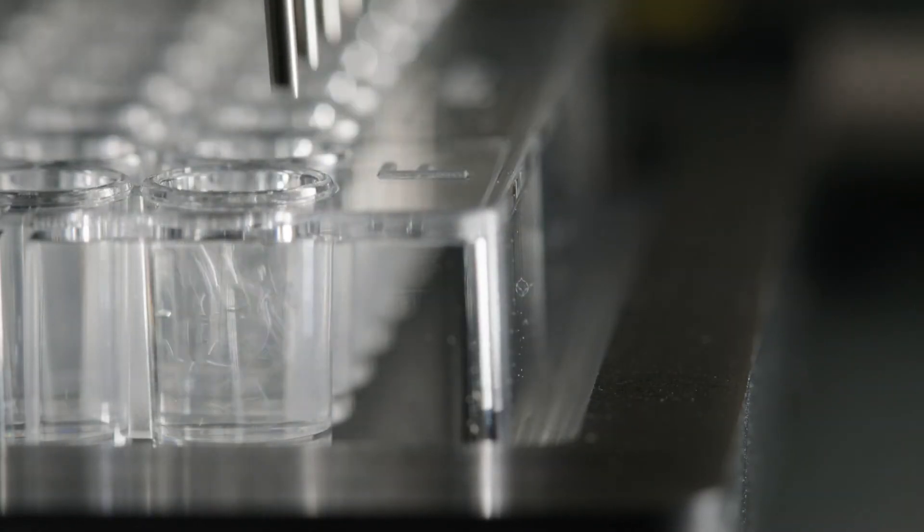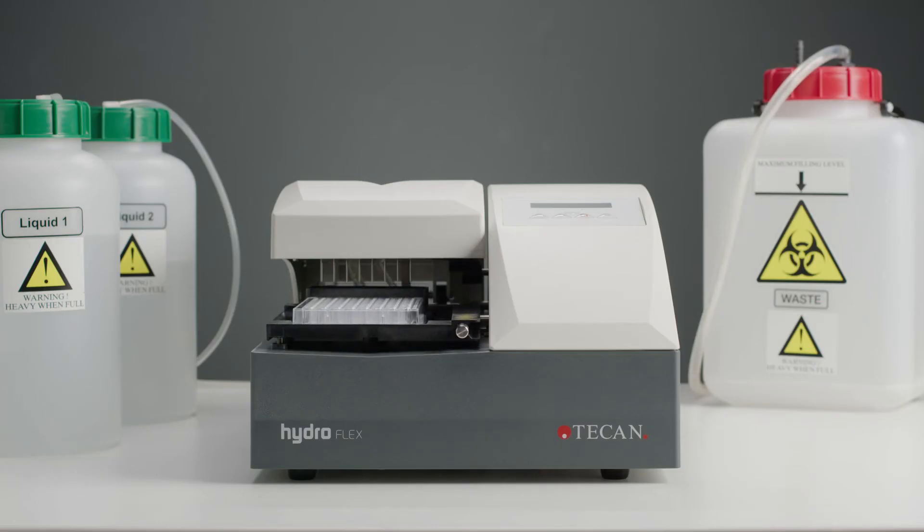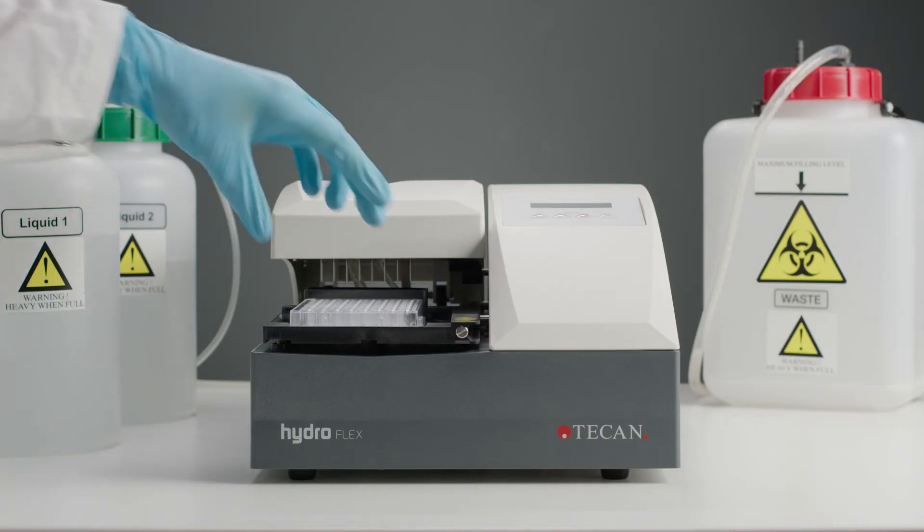If the plate definition file is to be used in different WASH programs, it is possible to set a custom Z position that will only be used within this specific program.